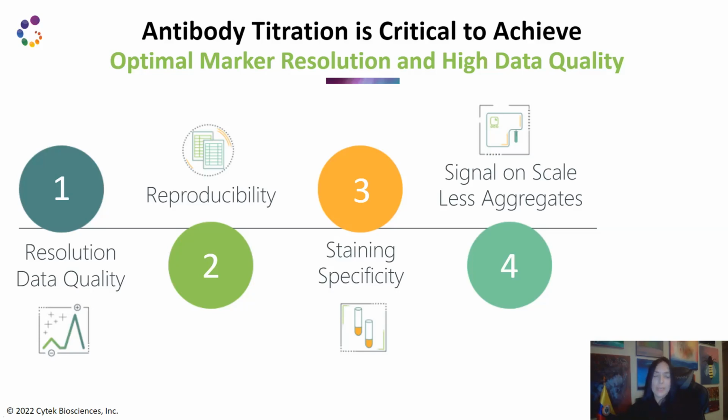And something more not related to data quality, but more to the efficiency of the assay, which is saving money. Most of the time, the optimal titer is less than the recommended concentration.